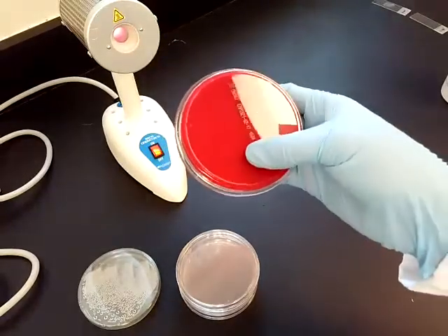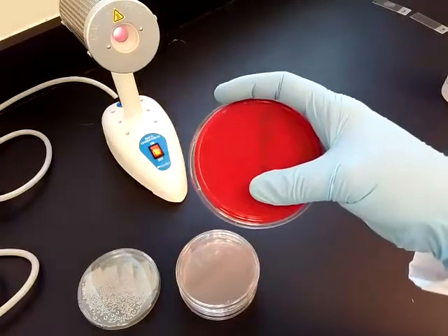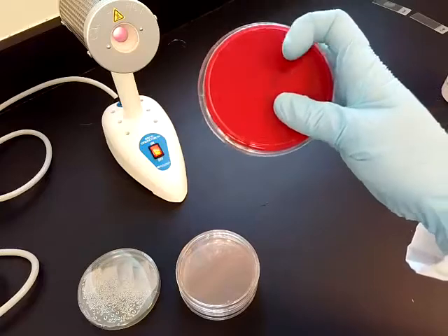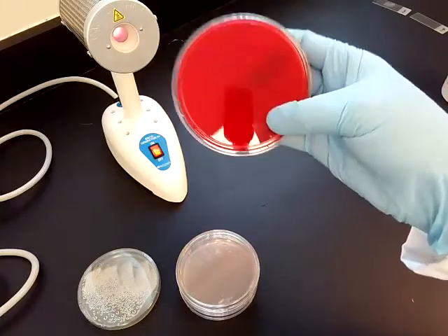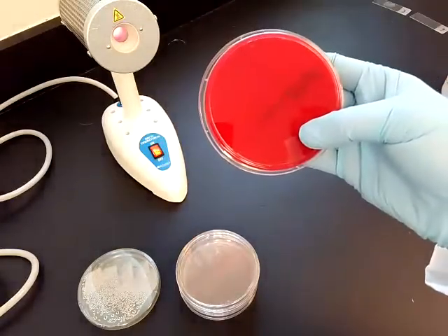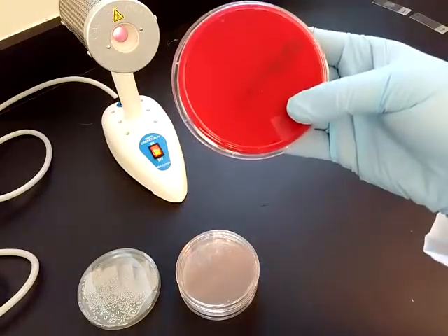When bacteria is put on this medium, it's going to either not break down the blood at all, and that's known as gamma hemolysis. If you see gamma hemolysis, you won't see any breakdown of blood around it. You're just going to see pure colonies on the surface with no disruption of the color of the actual agar. There can be partial hemolysis, known as alpha hemolysis.